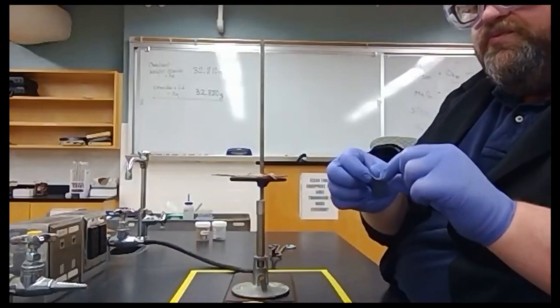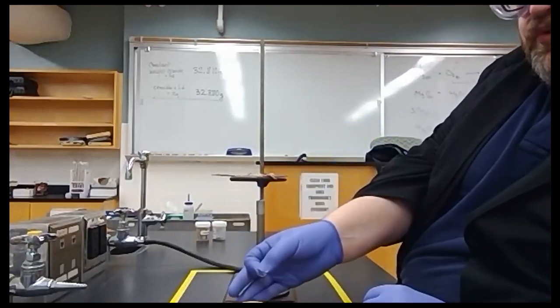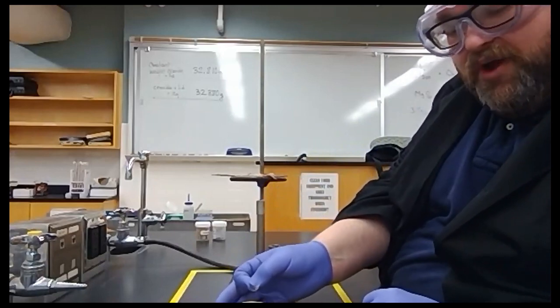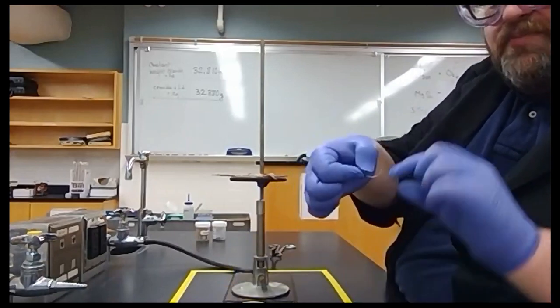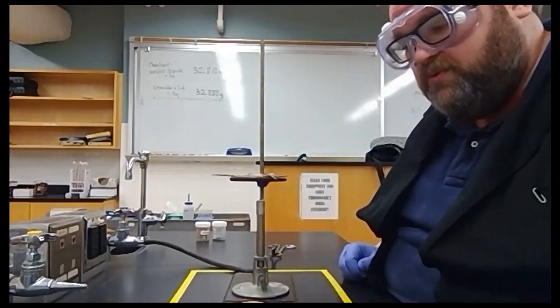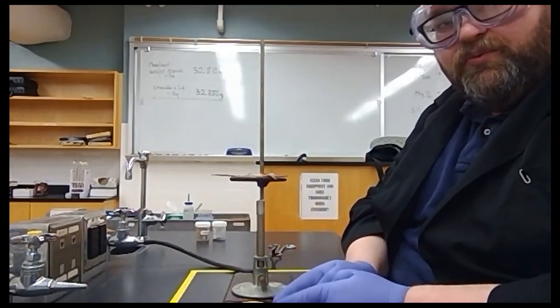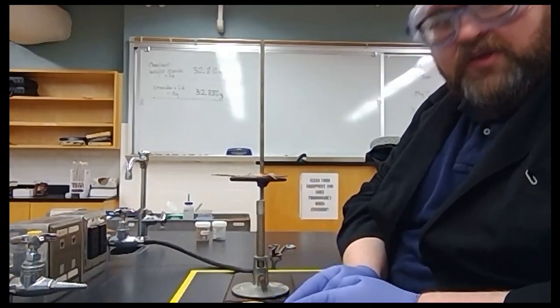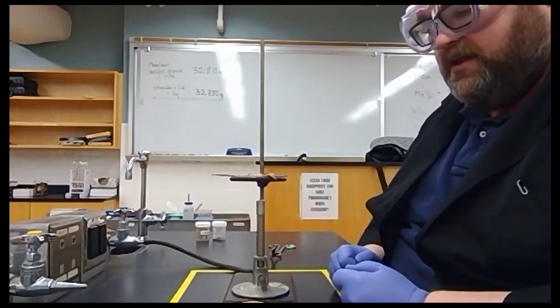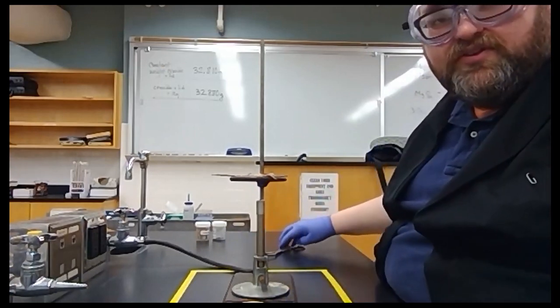We're going to slightly curl our ribbon. We need this ribbon to sit really tightly against the bottom of the crucible. So we're going to curl it up into a smiley face shape and then we're going to drop it right into the bottom of the crucible. We're going to weigh the crucible with the magnesium and the lid so that we can obtain the mass of the magnesium.